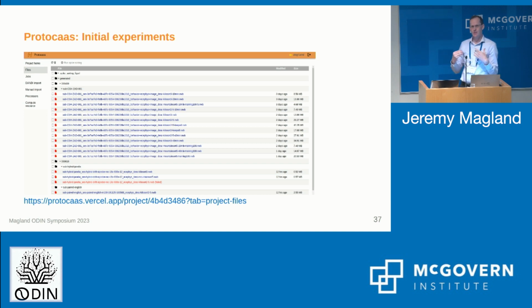So we can run a Python script that accesses this data and asks what the consistency is between these two sorters, and begin to come to a consensus on how consistent the different methods are, which units are reliable, et cetera.